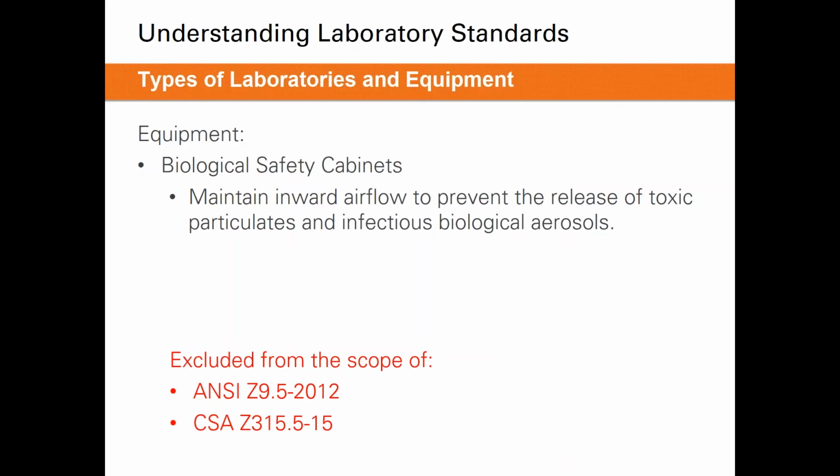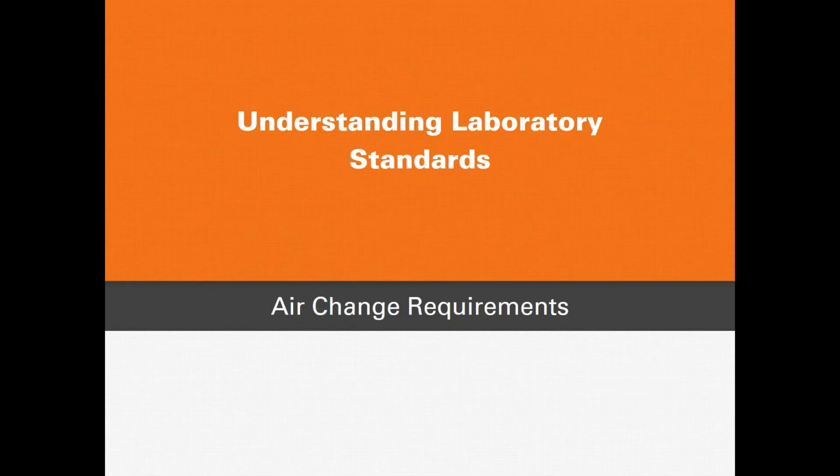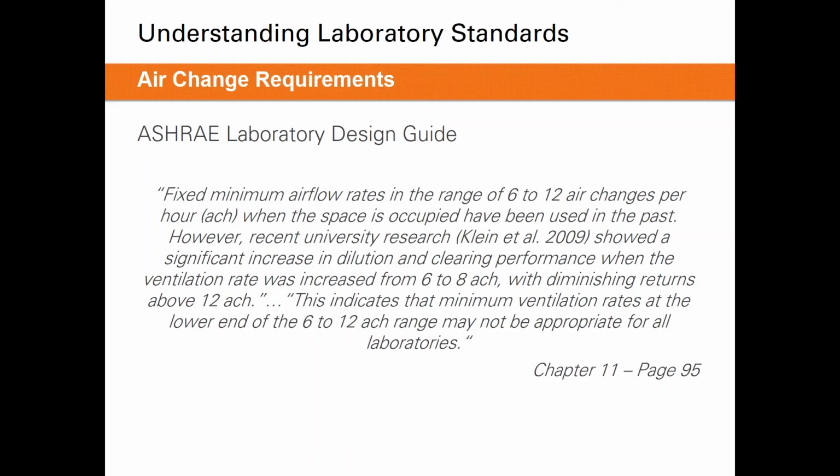So our next topic will be air change requirements. Air changes per hour in a laboratory are important to ensure that any potential airborne hazard is properly diluted and exhausted. We'll go through the following standards that cover the typical recommendations for air changes that would be required in a laboratory. The first one that we'll talk about is the ASHRAE Laboratory Design Guide.